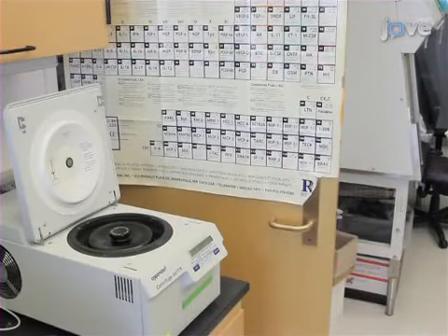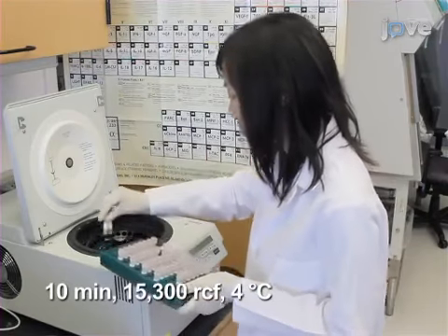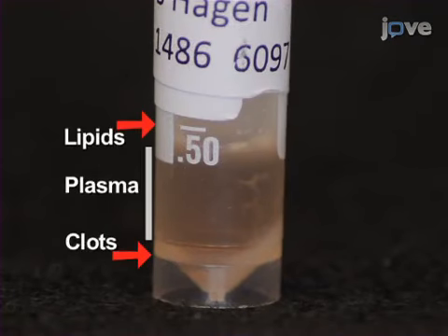On the day before the experiment, spin down thawed plasma aliquot samples for 10 minutes at 15,300 RCF and 4 degrees Celsius to separate the clots at the bottom and the lipids on the top from the plasma.